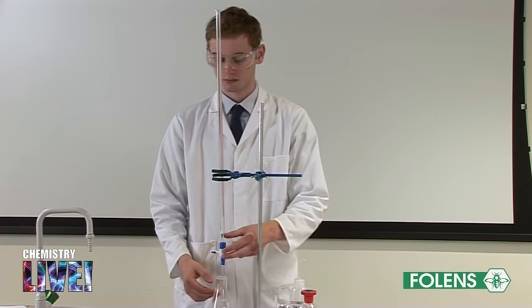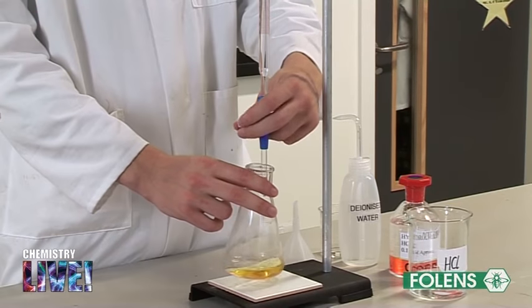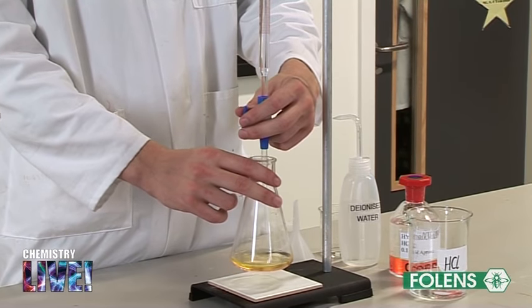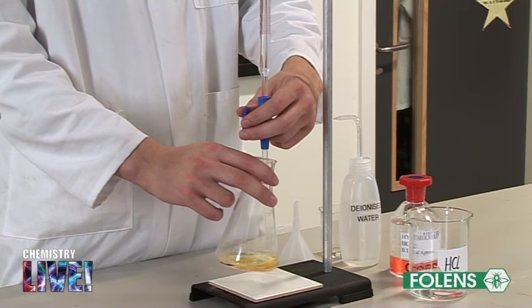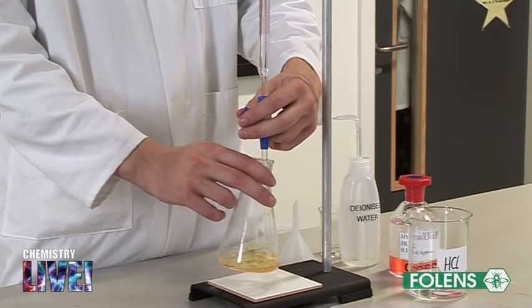Using the thumb and first two fingers of the left hand, open the tap of the burette. Allow the acid to run fairly quickly into the conical flask. The conical flask should be continuously swirled with the right hand.